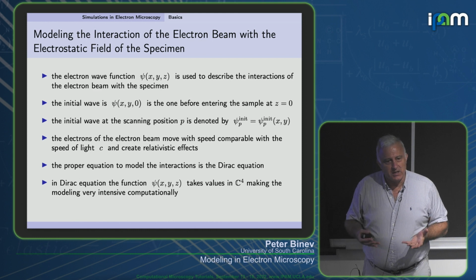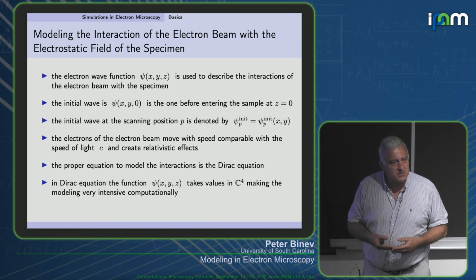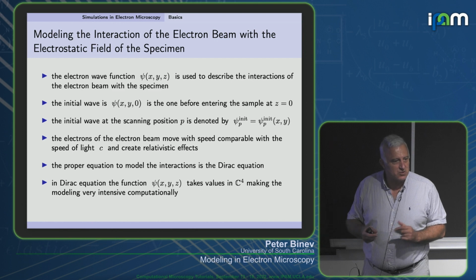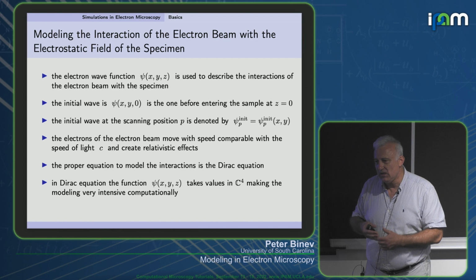That is 25 million times, then another 100 more to get away from the frozen phonon simulation.